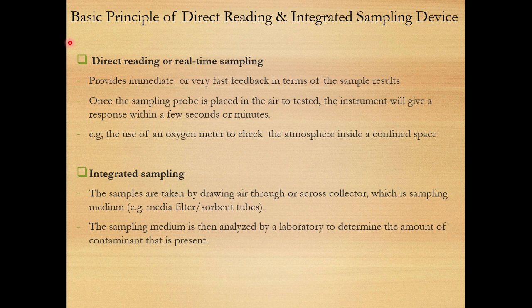Okay, this is the basic principle of direct reading and integrated sampling devices. Direct reading, or widely known as real-time sampling, provides immediate or very fast feedback in terms of the sample results.